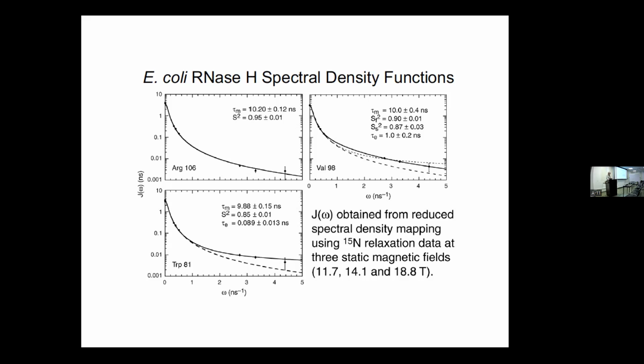And those are determined primarily by the NOE experiment. And the NOE experiment is the least sensitive experiment of all of these, because the NOE sequence doesn't start with an INEPT. We have to start with Boltzmann equilibrium of the nitrogen spin. So the sensitivity is way low compared to the T1 or T2 measurements. And that's a little bit unfortunate because it's so critical for determining the internal correlation times.